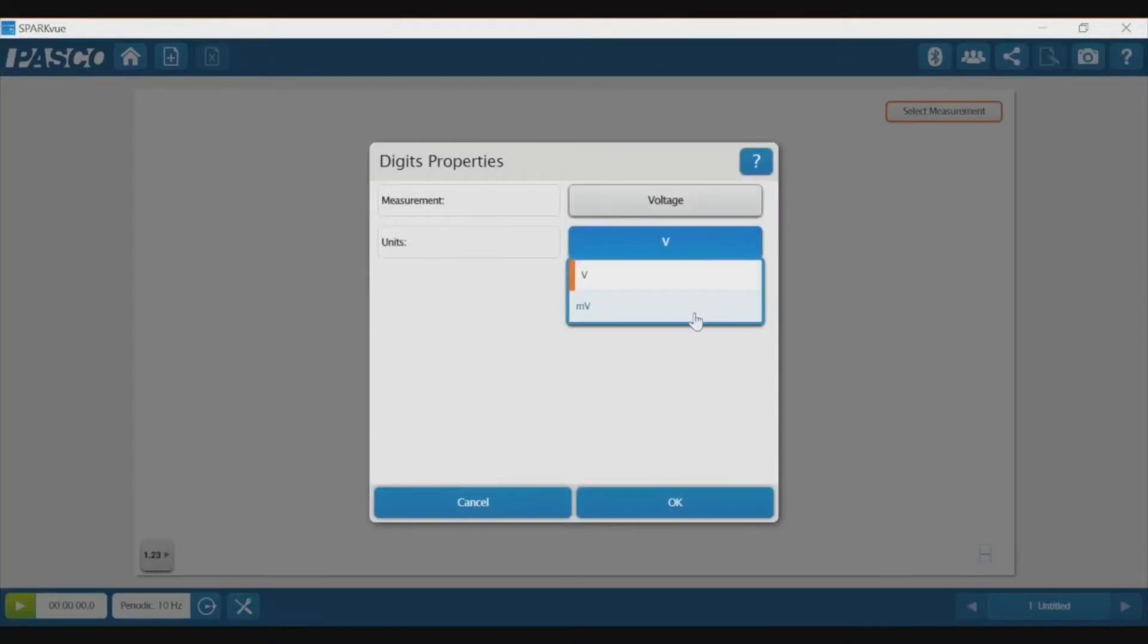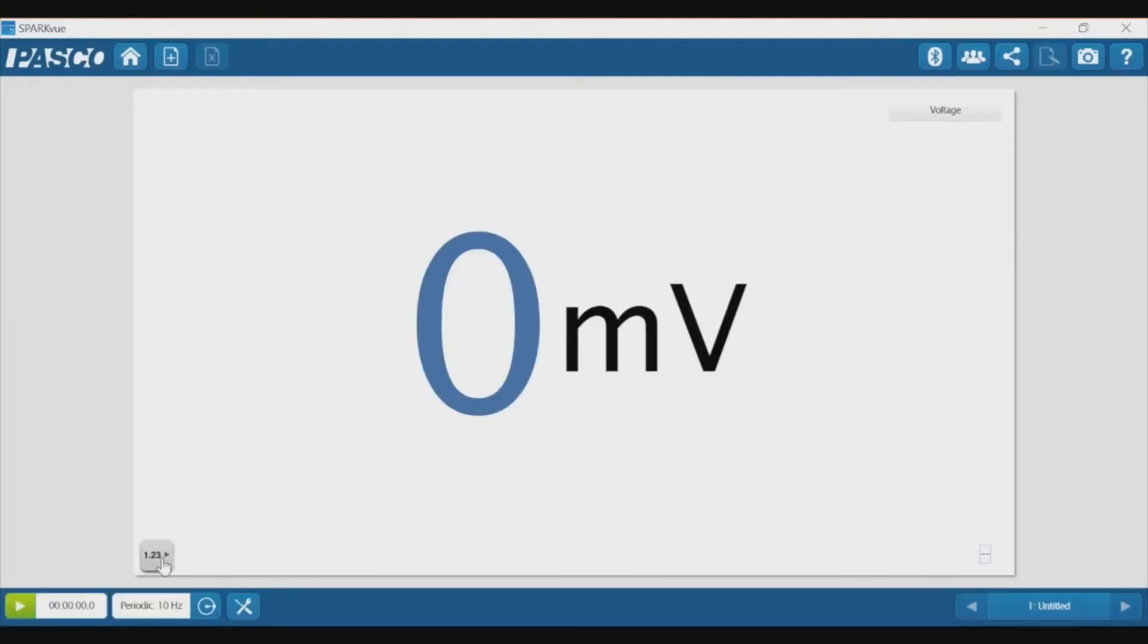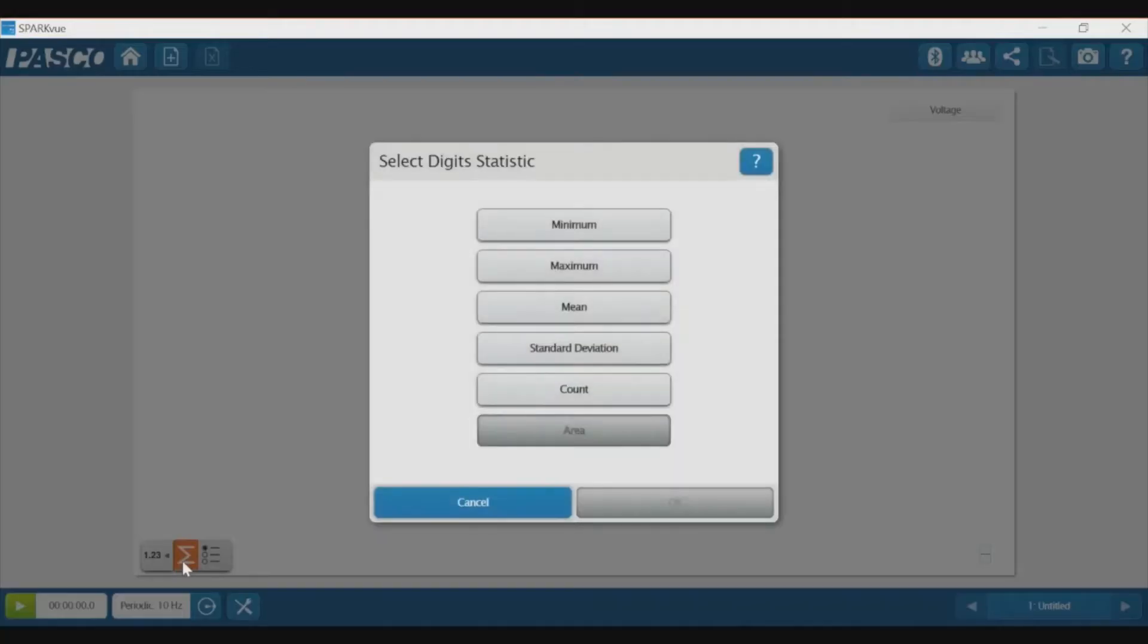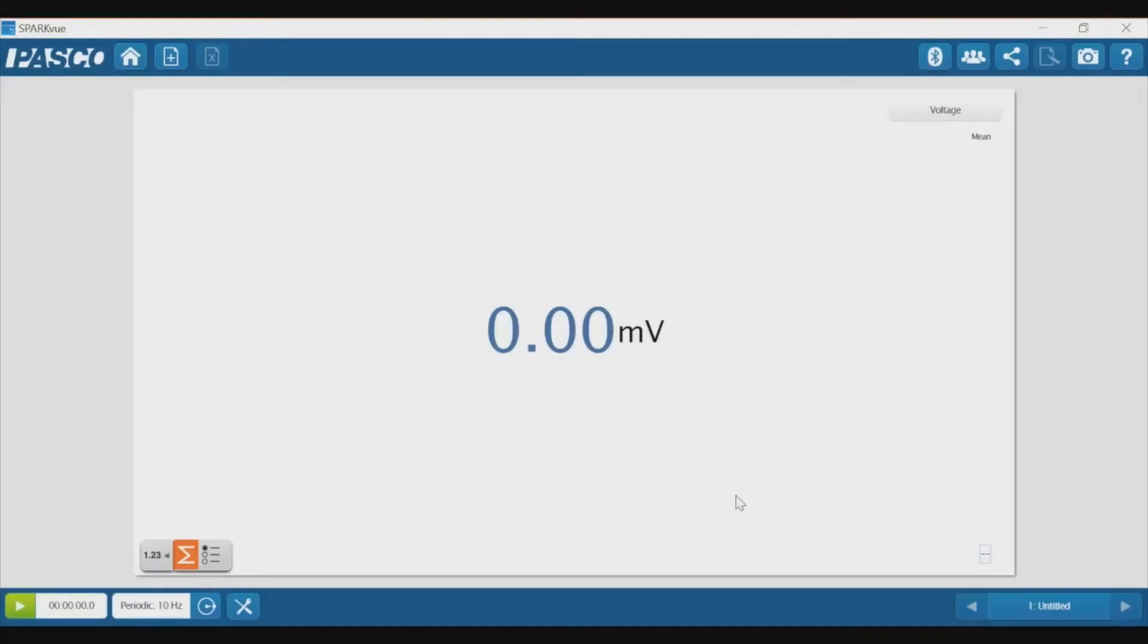Change the units to millivolts. In the lower left corner, click on 123 and then the sigma symbol. Then choose Mean. This will average the voltage data, which helps to reduce the experimental noise that might impact your results.